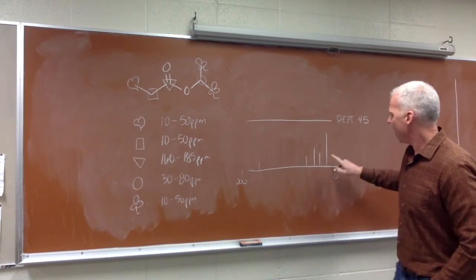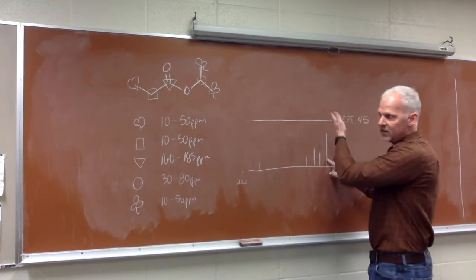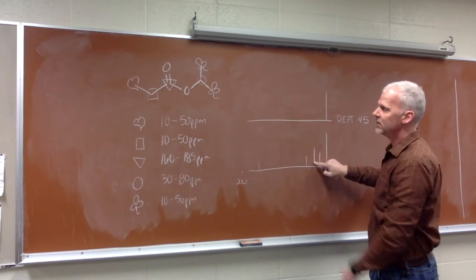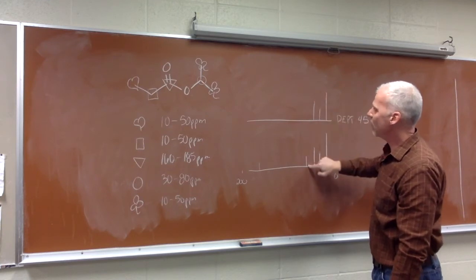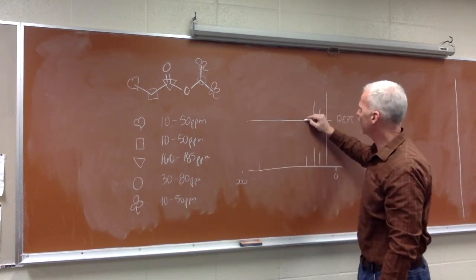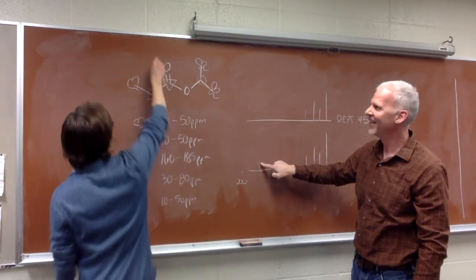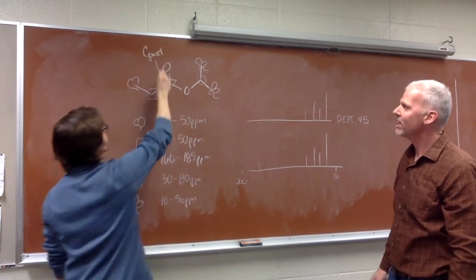So in this case here, if this one, say, was the two methyl groups, the clovers, I did draw that a little taller because it's being caused by two carbons, that one would show. And then the other aliphatic ones, for the other CH3 and the CH2, they would show as well. And then the one that's attached to the oxygen, the CH there, that would show. But the carbonyl out here doesn't have any hydrogens attached. And maybe it just makes sense for us to mark that here. So this is a C quat is what we refer to them as.